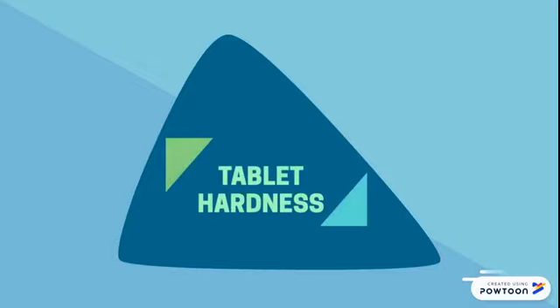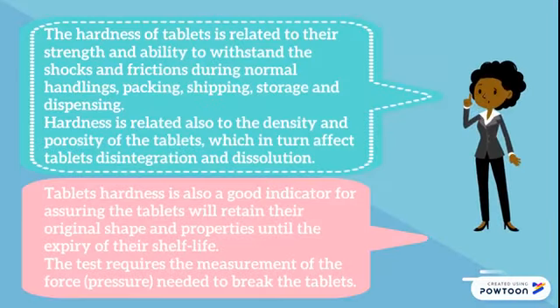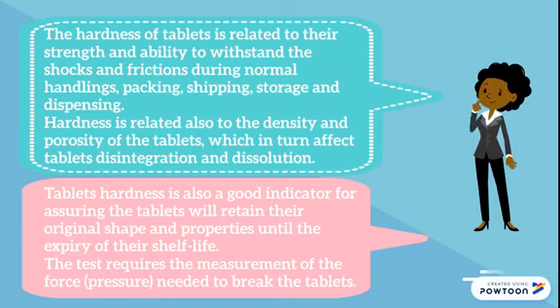Tablet hardness. Hardness of a tablet is related to its strength and ability to withstand shock and friction during normal handling. The test requires the measurement of the force needed to break the tablets.